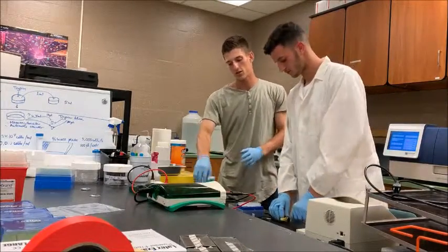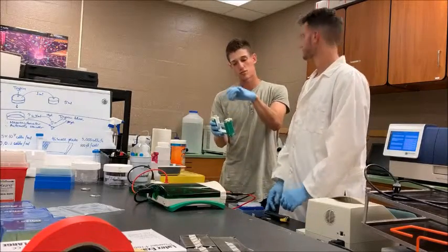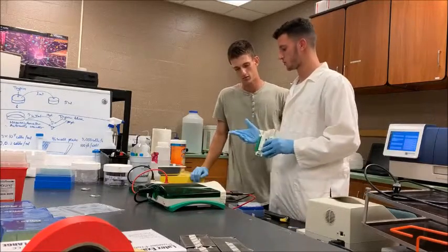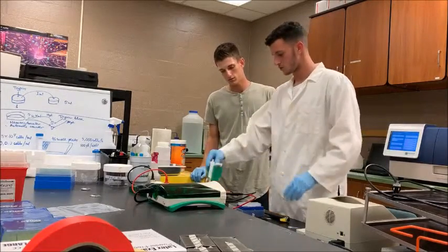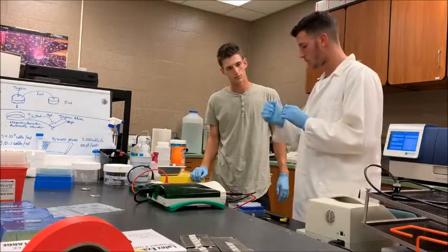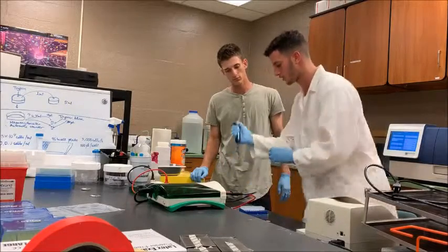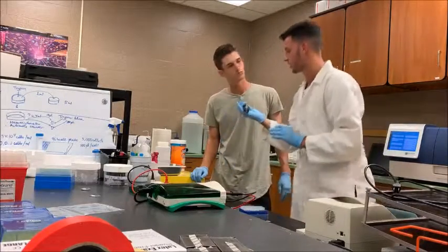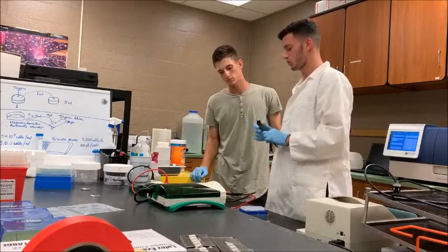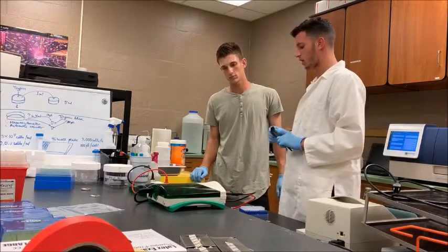It's kind of hard to load the samples into the gel, right? Because the wells are so small. Yeah, that's the hardest part, and where students usually make the most mistakes. That's why you will be using specific white tips that are really small that will go in the well, and then you have to have a steady hand. Usually we'll get in this position to hold it really steady, and you will slowly load the solution into the gel until you see it, thanks to the Laemmli dye.